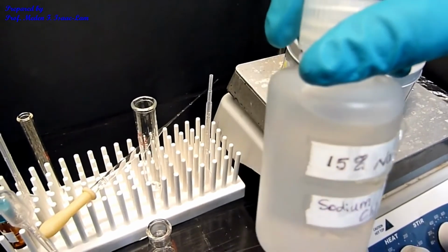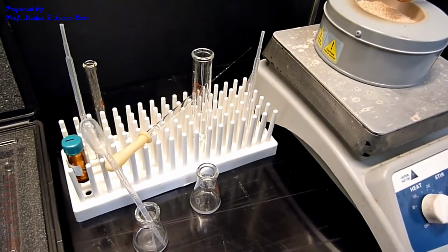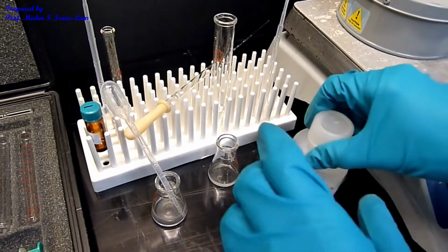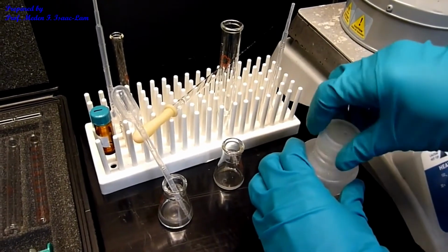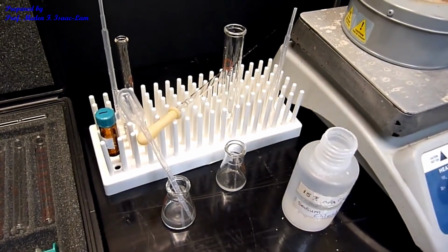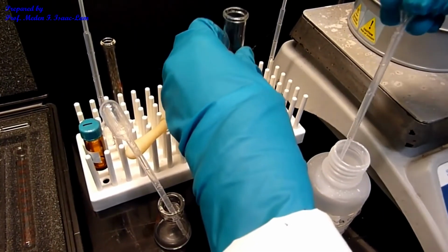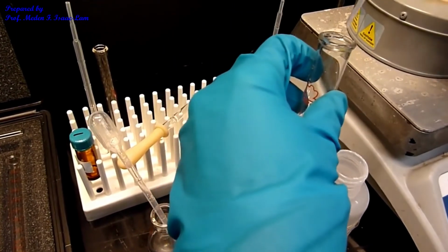I want a salt because it's like a salting out effect. And again, to wash again, but I want salt because in case it's just water, sometimes if it's not ionic enough, you will not see the layers. I want a salt solution, which is just brine and sodium chloride. And I'm going to add again 2 mL. So this is just NaCl. So approximately 2 mL.